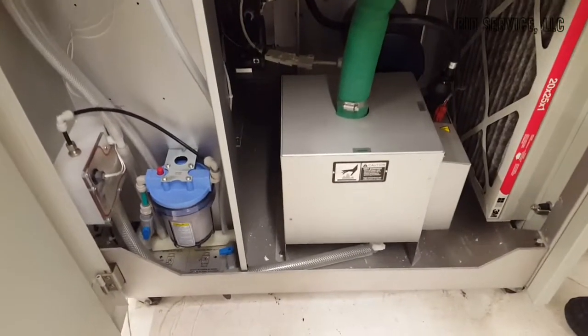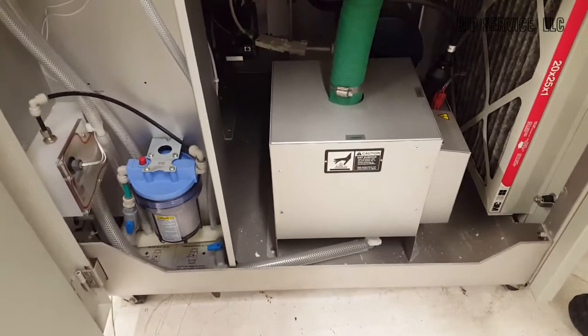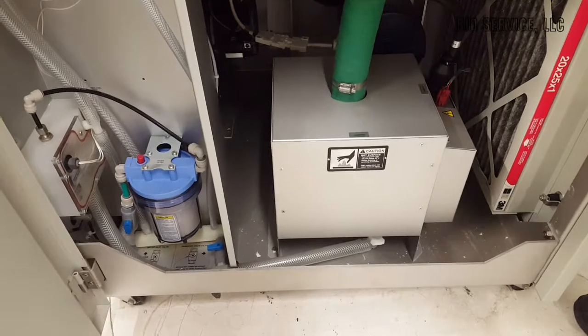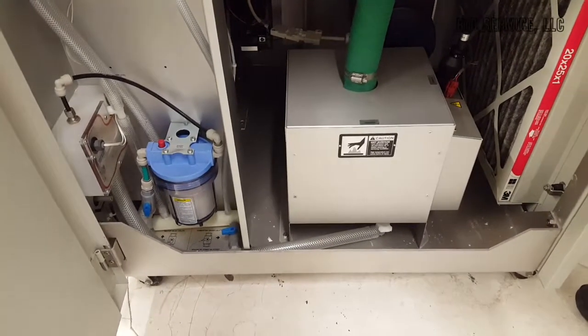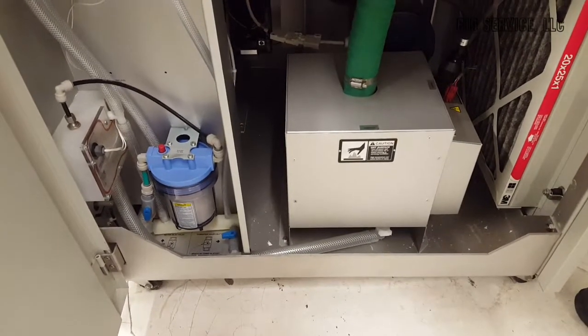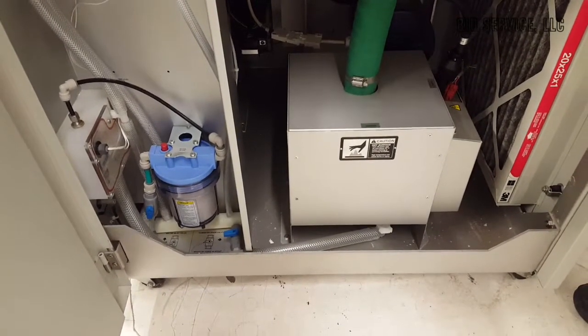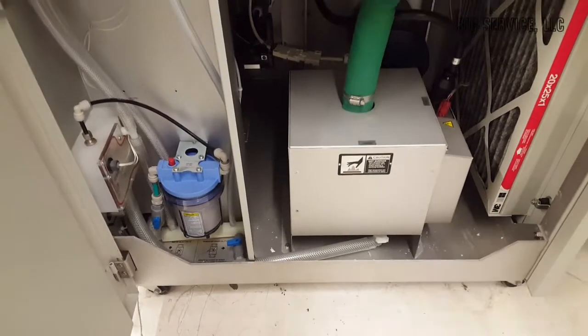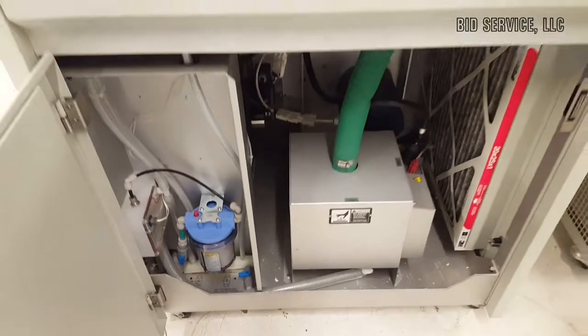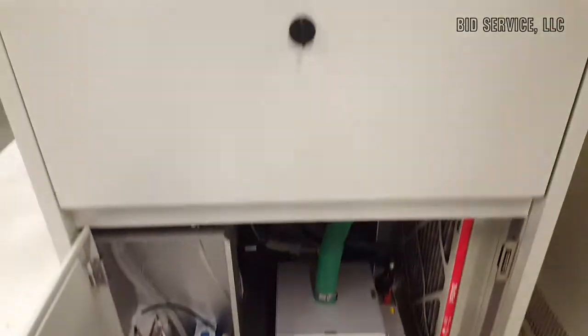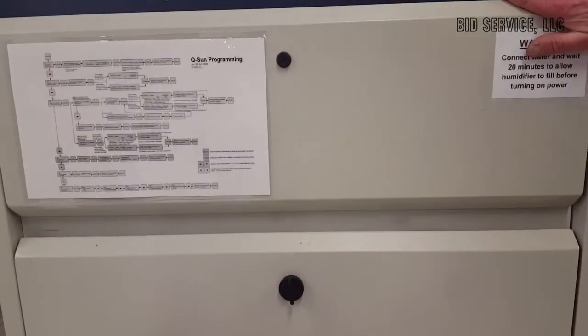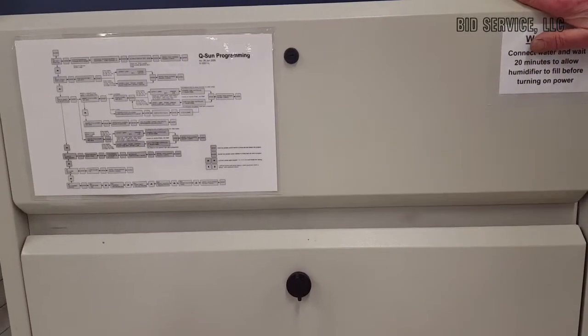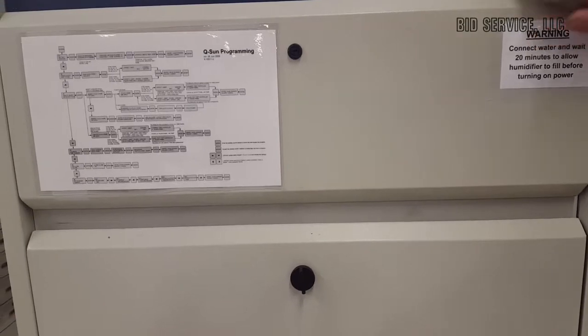Depending on the pressure from your house water, it may take a little bit. It is a small line. But as long as you give it a few minutes, that's with the power off. It'll naturally push itself in and fill itself up.